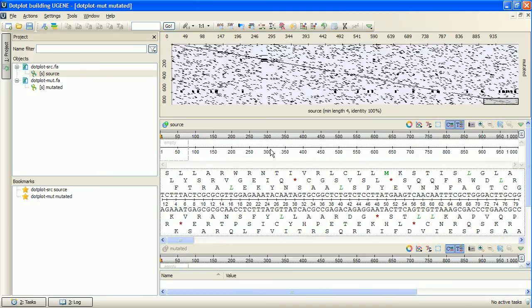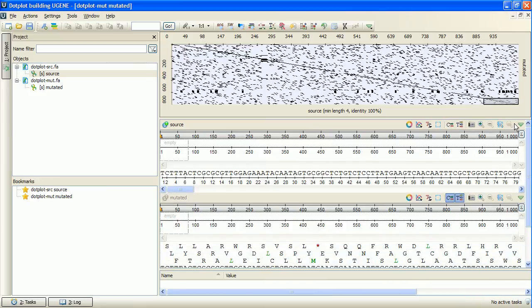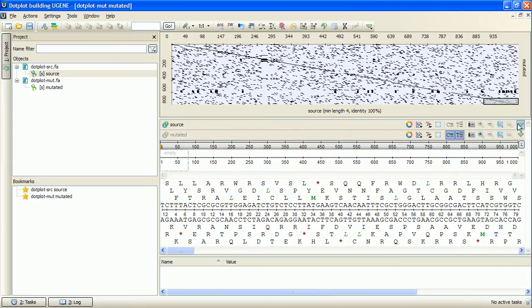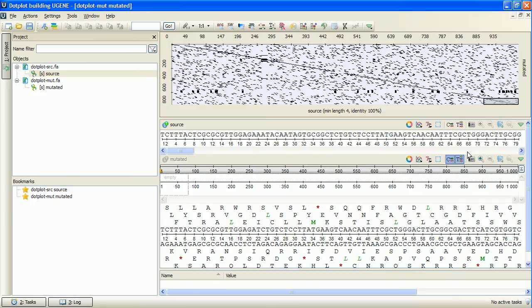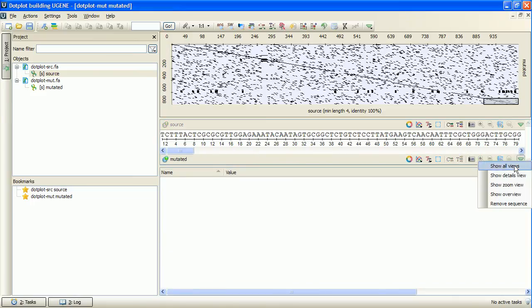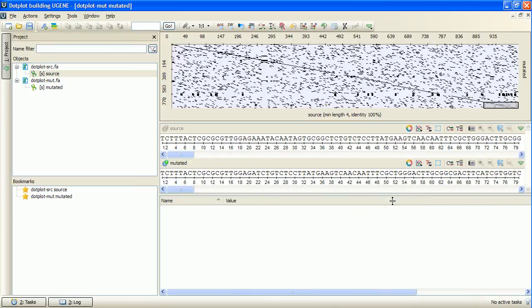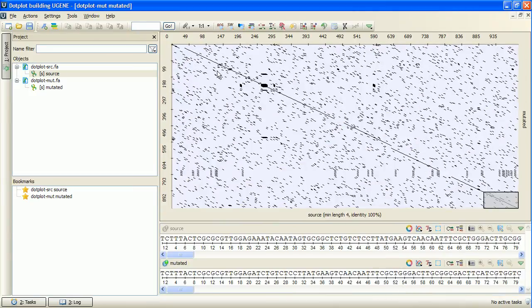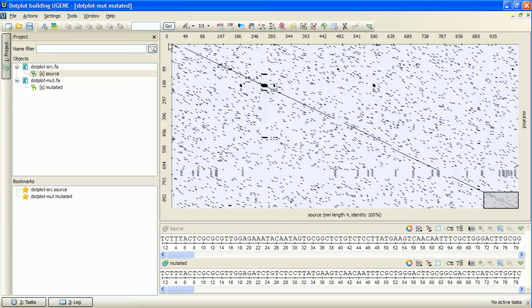The dotplot is built and displayed. I will close the unnecessary strands and views. Every dot on the plot corresponds to a matched base symbol at the x-coordinate position of the horizontal sequence and the y-coordinate position of the vertical sequence. The diagonal line indicates the match between the comparing sequences.